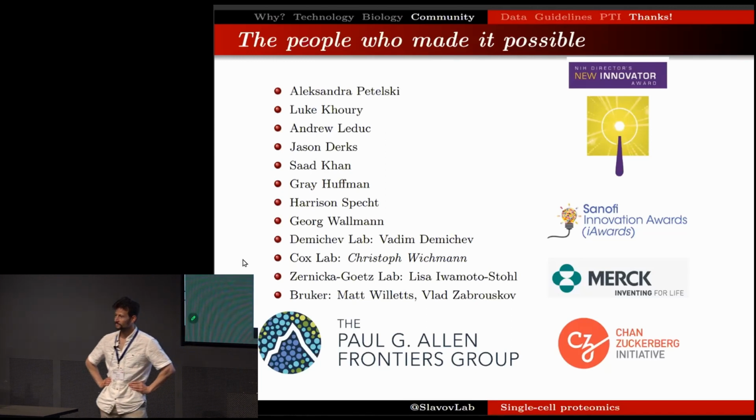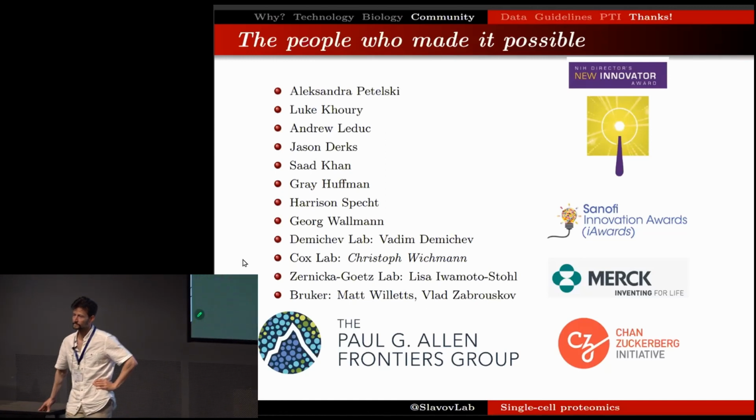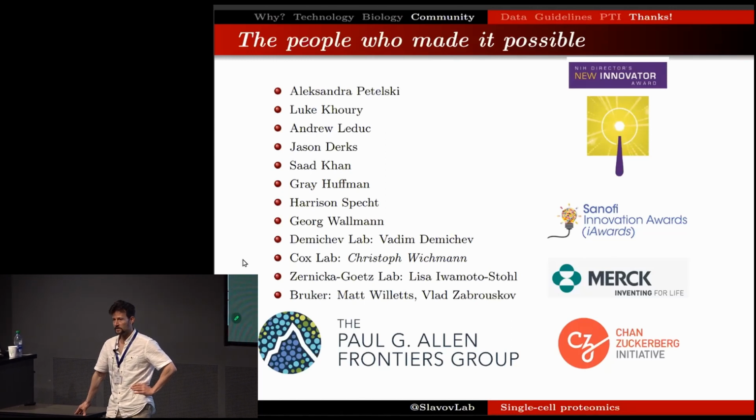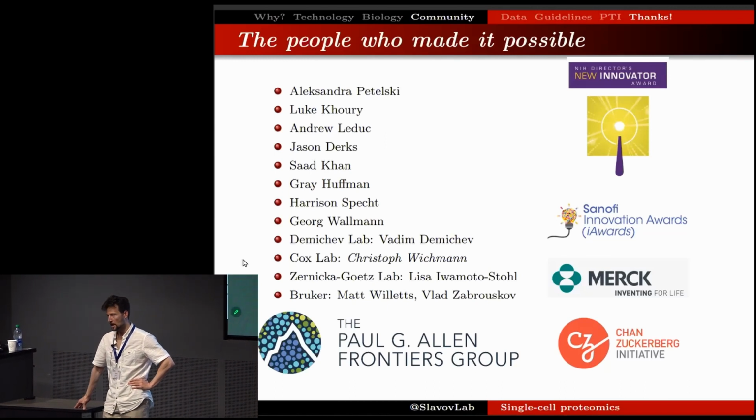Hi, I'm curious if you have done any work dissociating more complex tissues for single cell proteomics, like brain? Brain we haven't done. We have dissociated testis, we have dissociated lung, we have dissociated different tissues. So in principle, that can be done.